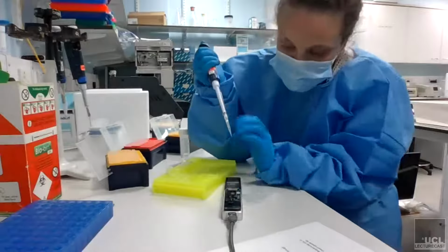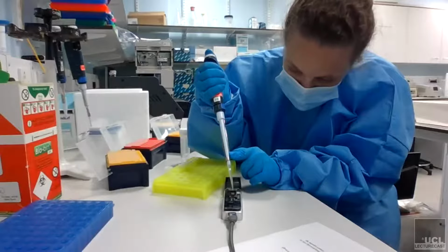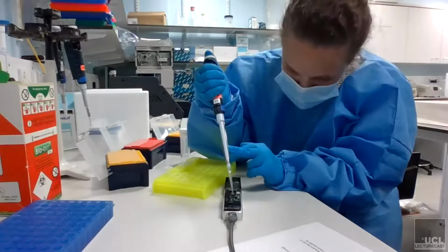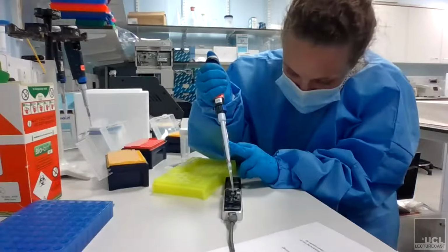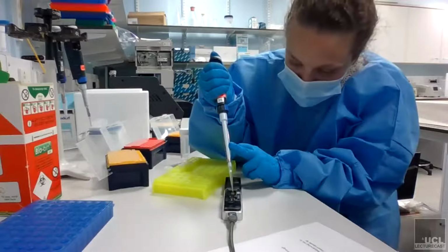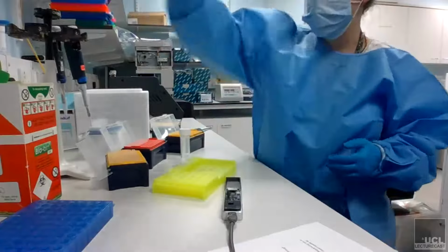With this, you don't press the pipette tip into the hole. All you need to do is gently hold it over, and it will get sucked through. You can just gently drop it, and the sample will move across the flow cell panel like that. And then that's it, that's done. That is your sample loaded.